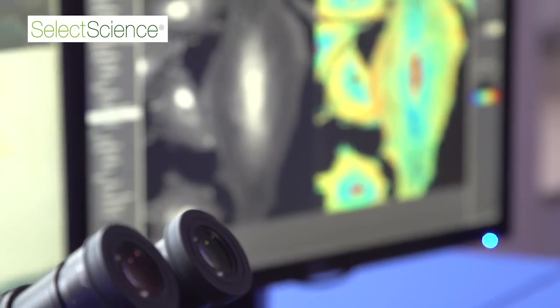How is the equipment of the facility helping research and researchers? They are answering their scientific questions. So if you are questioning how cells are moving, why or where, you need to have a nice microscope that is able to follow it through time. If you are interested in development or description, you need to be able to do large view and zoomed view, with nice pictures, in order to have enough information to describe the architecture of the tissue itself, and then explain how it is developed through time.